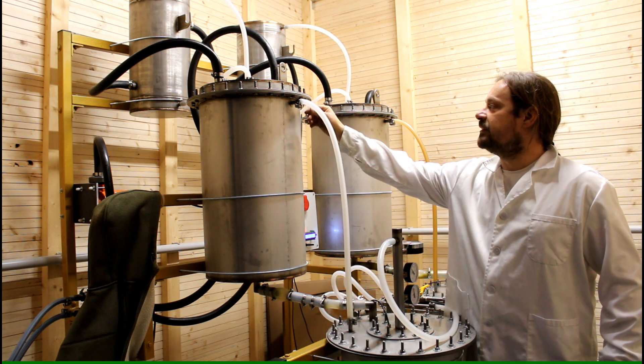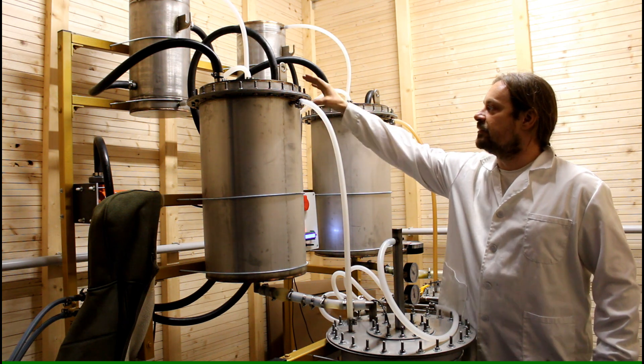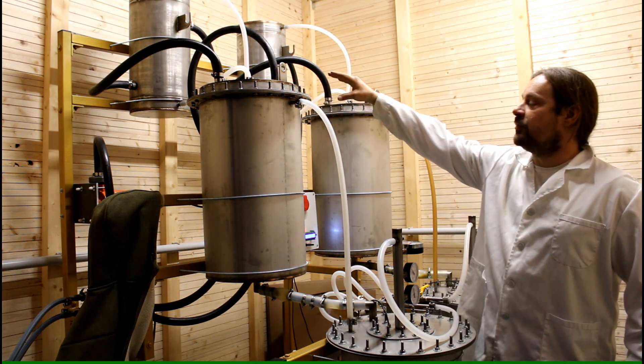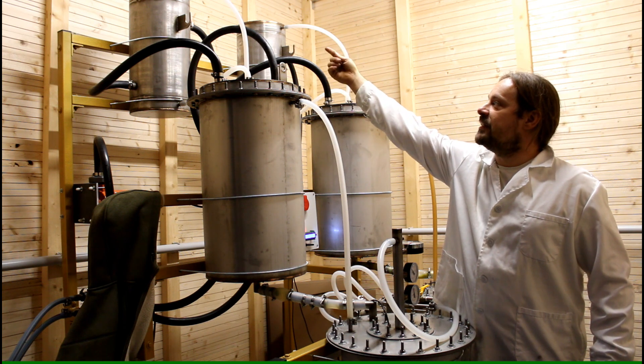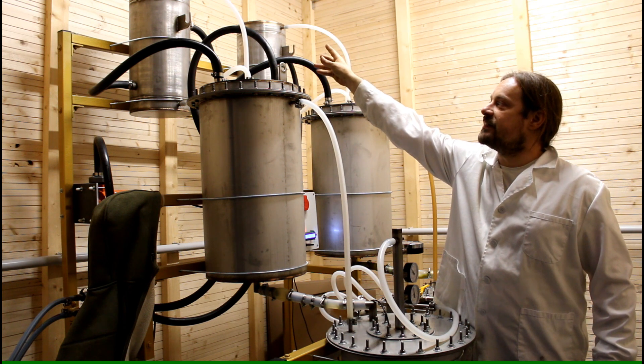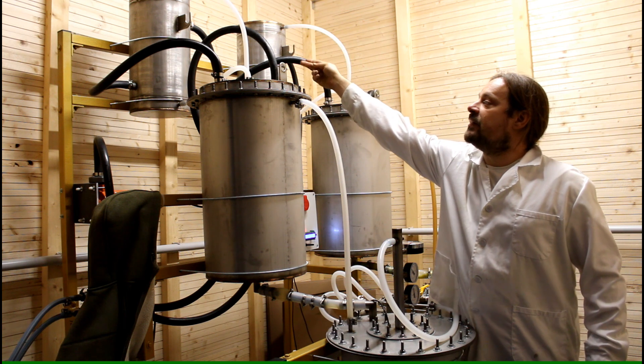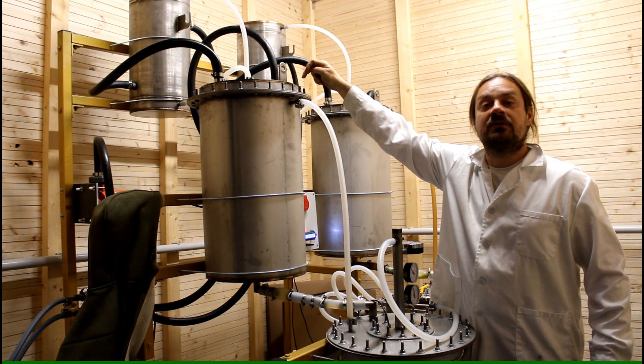And what happens next is that the solvent will be heated up. When the solvent starts to evaporate the steam will come up here in this tube and start condensing on this lid here. And whatever does not condense here will go to the second stage to the second condenser, will condense there and run down onto the herbs.